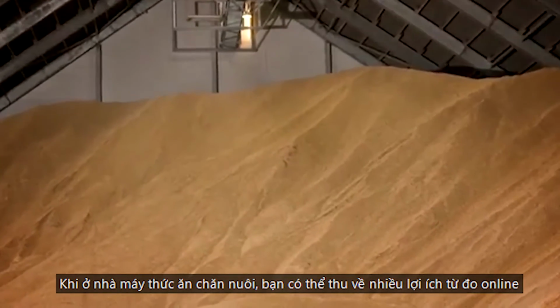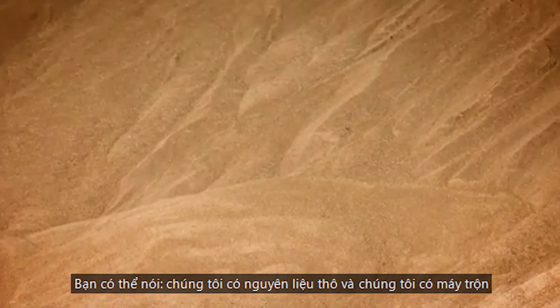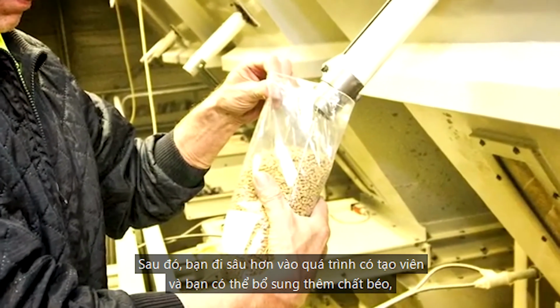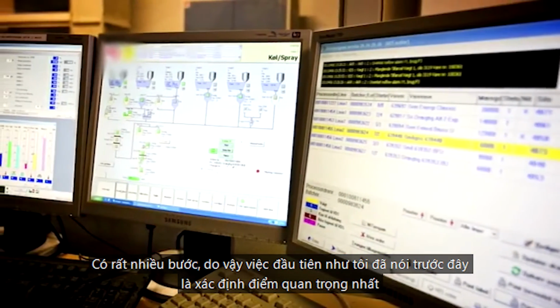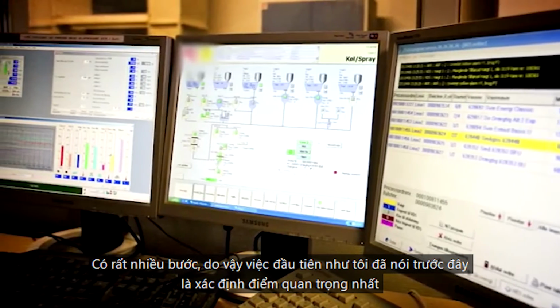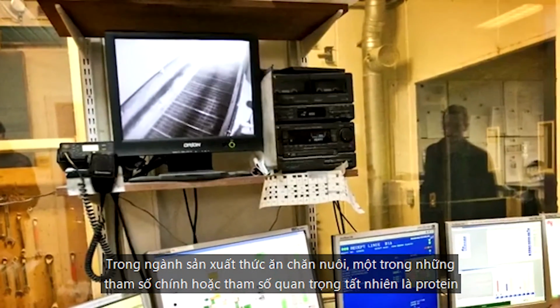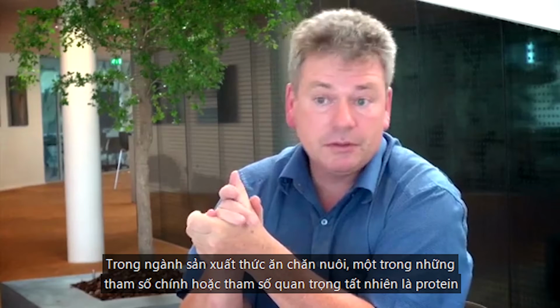If you take a feed mill, there are a lot of places where you can add value by going inline. You can say, okay, we have the raw materials, and we have the mix of the raw materials. And then, of course, if you go further into the process, then you make pellets and you maybe add fat. There are a lot of steps. So to identify the most critical point is the first step, as I said before. Here we can say, in some types of feed, one of the main or important parameters is, of course, protein.